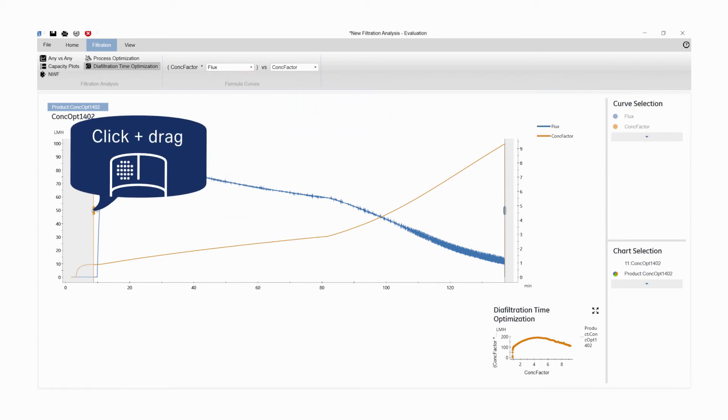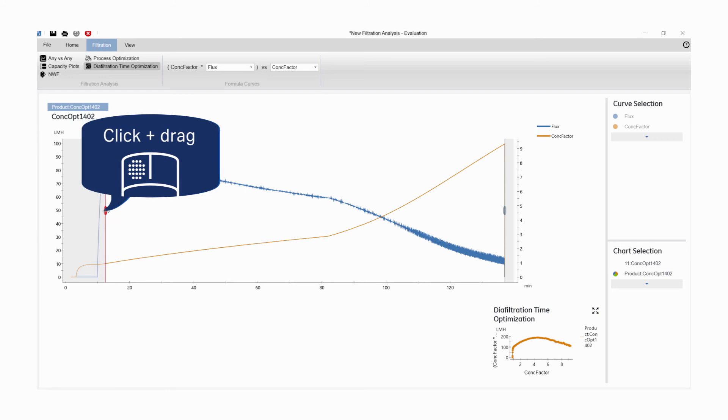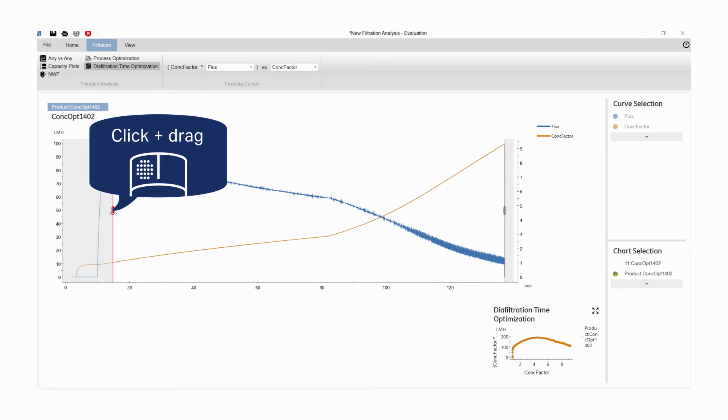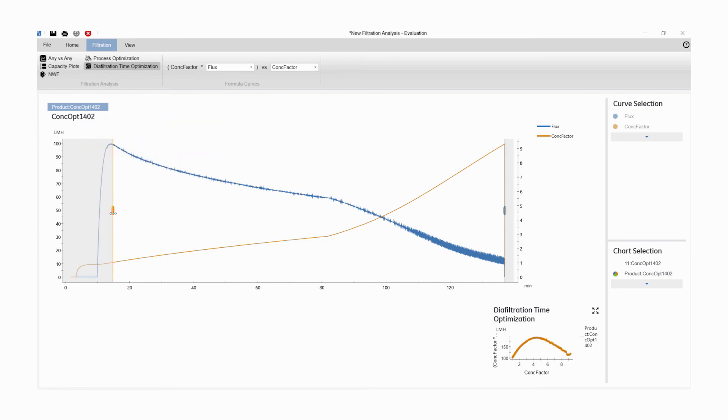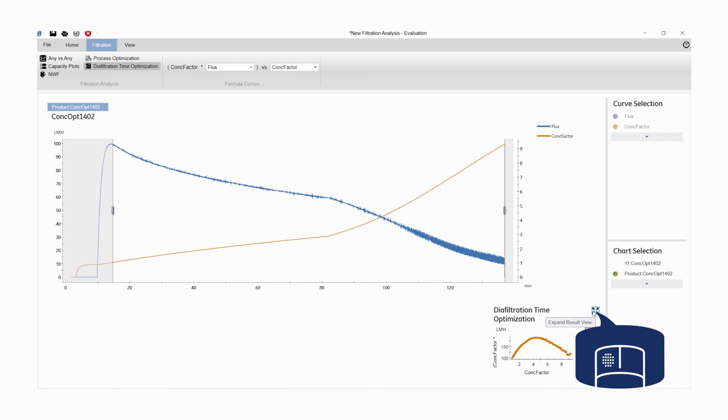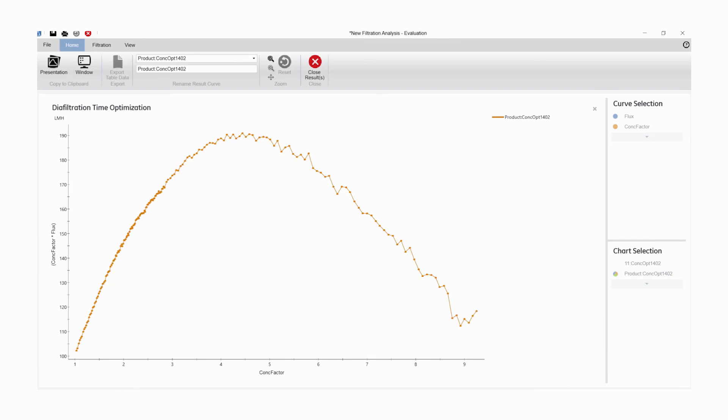By dragging the selection windows, you can select the area to be analyzed from each plot. Analyzed data from the selected area in each plot can be viewed in the result view in expanded mode. The highest value on the y-axis corresponds to the highest concentration on the x-axis at which the diafiltration should be performed.